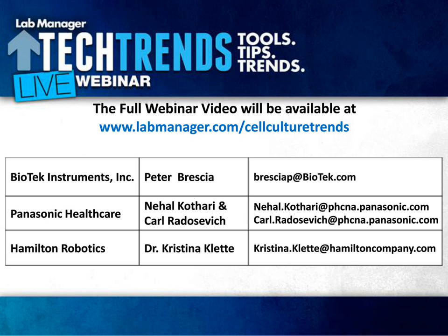But it sounds like this question is more directed to, can you put the plate in and image neurite outgrowth or something of that sort over a day or two. And I think the system should be suitable for that, and we're hoping to actually do some additional experiments here in the near future showing exactly that.